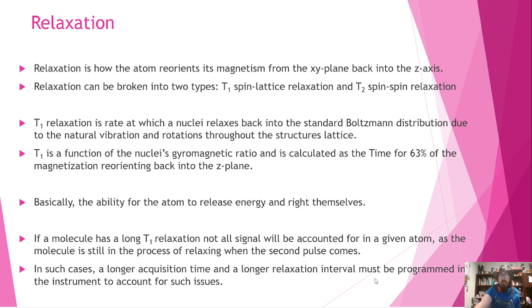So there are a lot of fancy NMR techniques you can do, like changing the relaxation times or changing how long it takes between pulses. It takes some programming skills, but it's possible to play around with this to get more signal. Some signals we will not be able to measure fully because they have a longer relaxation time.